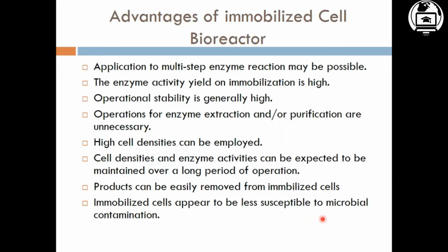Where there are multi-step enzymatic reactions, their application is quite possible in an immobilized cell bioreactor. The enzyme activity yield on immobilization is high. Whenever you immobilize an enzyme onto some surface, its activity is found to be higher. Operational stability is generally high. Operations for enzyme extraction or purification are unnecessary.